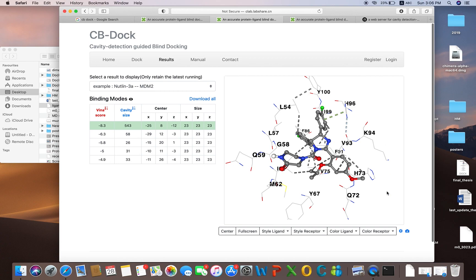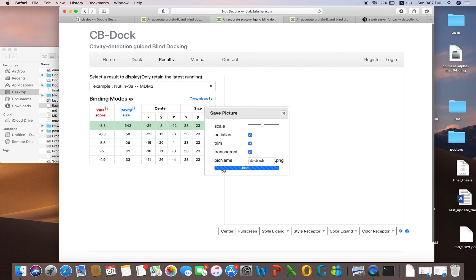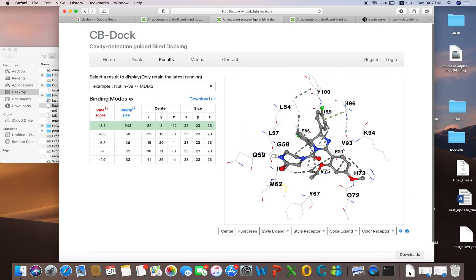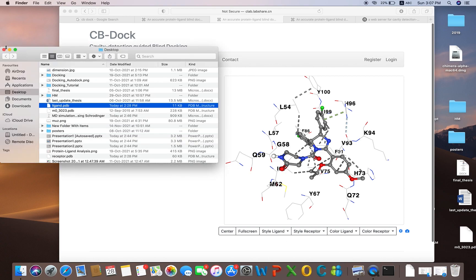These are very good interaction diagrams with the interacting residues. You can click the camera icon to export the image. Make the default parameters checked as well. While you click export, you can give any name to that picture — I am giving the name CBDock. By clicking export, the picture is downloaded.